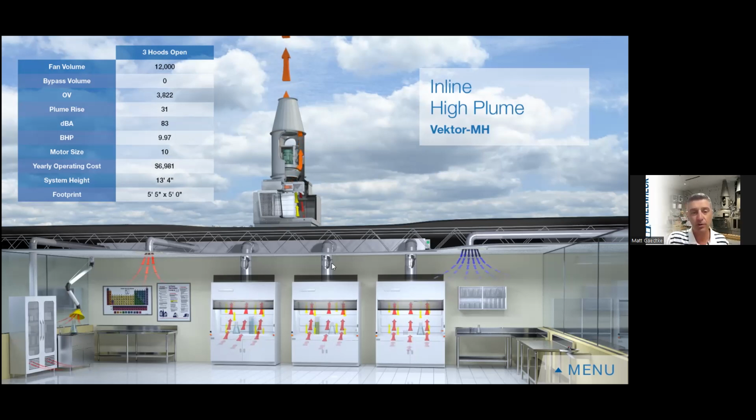The second control loop then has to do with the airflow going through my chemical fume hood. So I showed you how we can open and close that sash. You can see this little valve can open and close above that unit. So the easiest description of this is that I would have a sash sensor. When my sash is open, it tells this little damper or little valve what position it needs to be in to provide the appropriate flow of air to maintain 100 feet per minute or whatever safe velocity you have for that particular hood. When I close the sash, that valve shuts down, not totally, but enough to allow a small amount of air that's still opening.